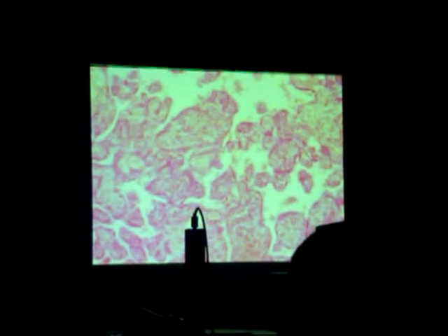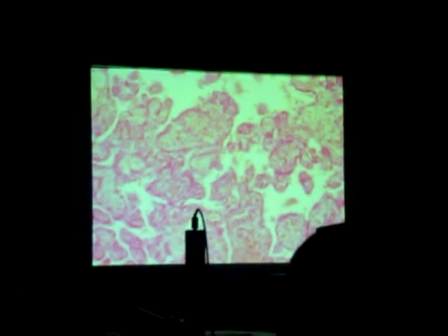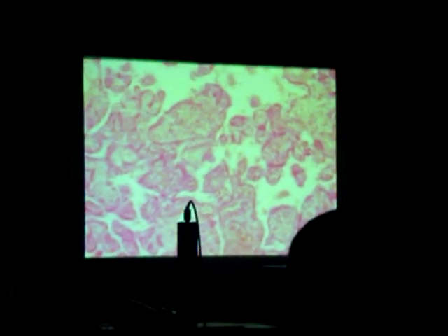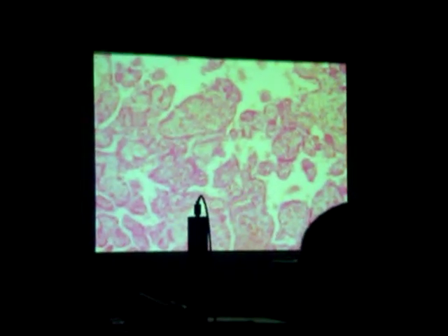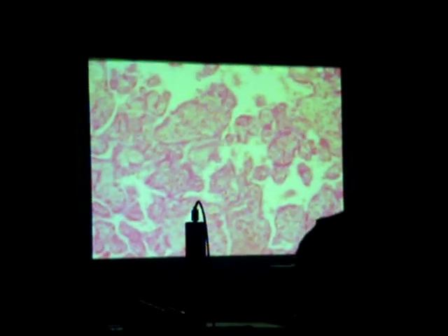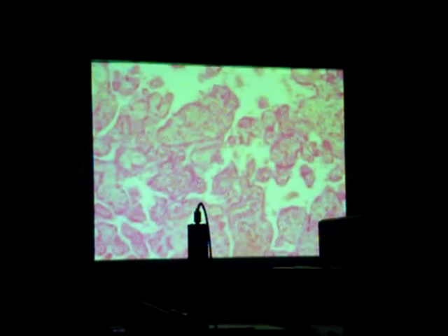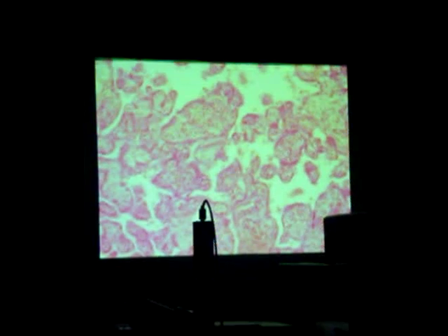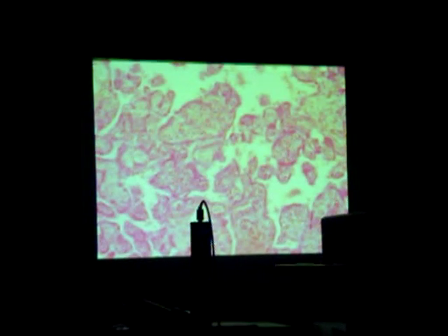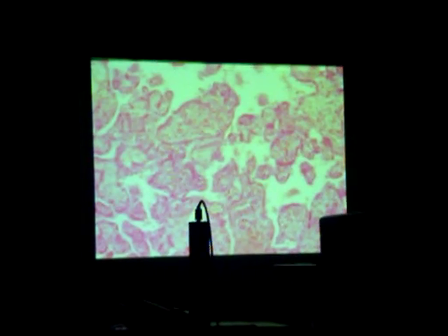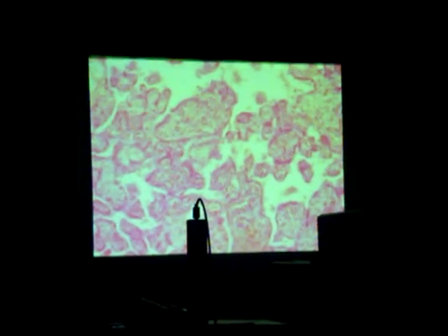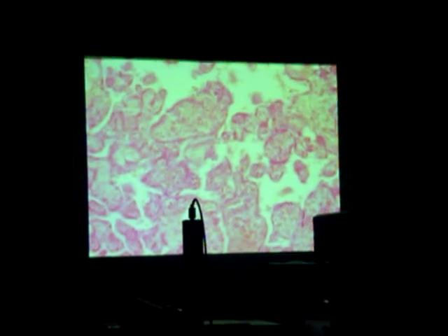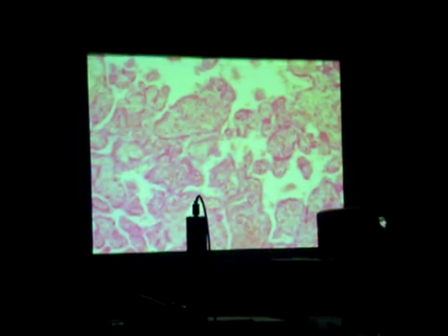You know, these pictures look exactly like what we had. The uterine glands are in — just what I said — the decidua basalis, and the villi are in the other. What I said was correct. Let me show you that again.